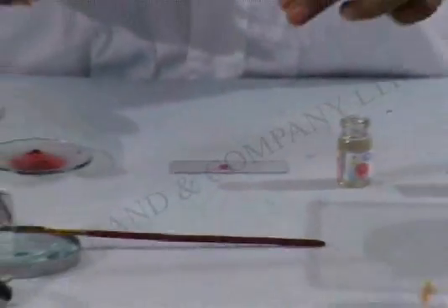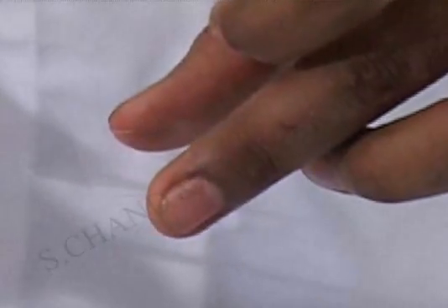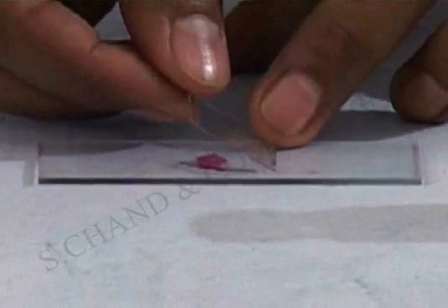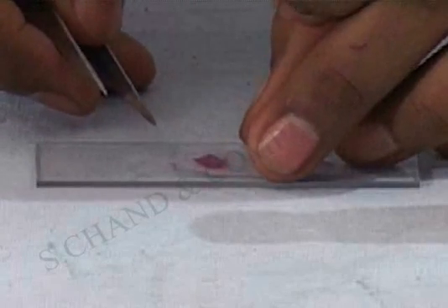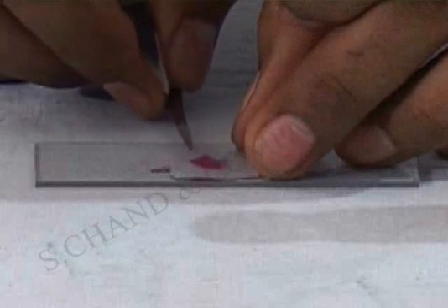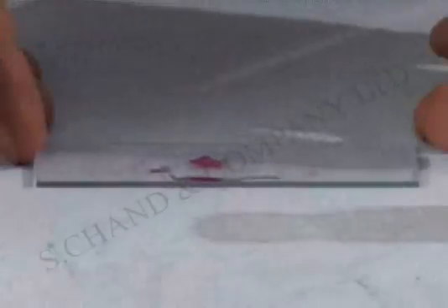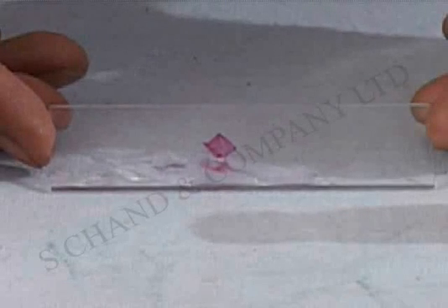Now, this is a covering slip with which we are going to cover the slide. While putting a cover slip, always make sure that there are no air bubbles trapped. As you can now see, the slide is ready for observation under microscope.